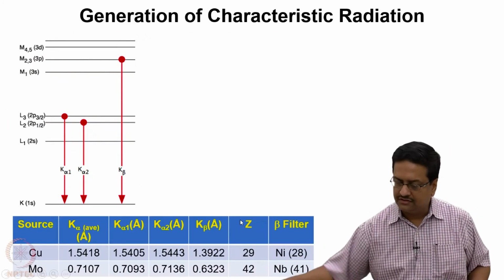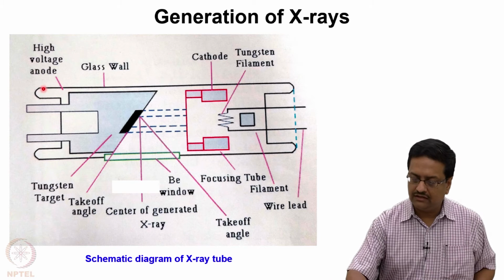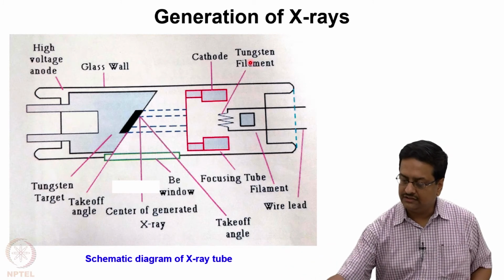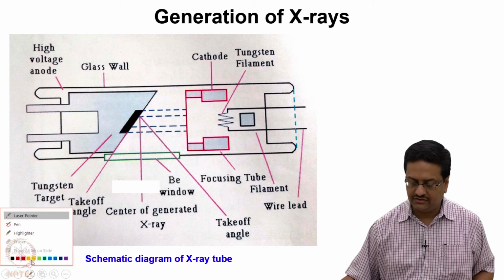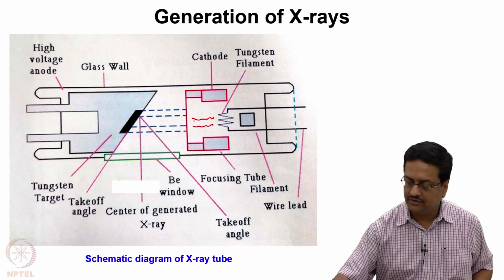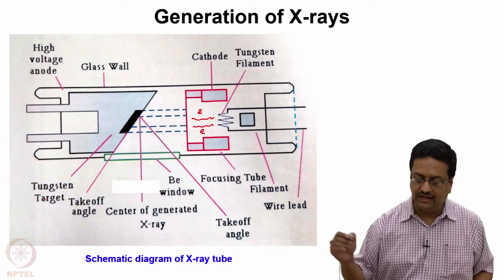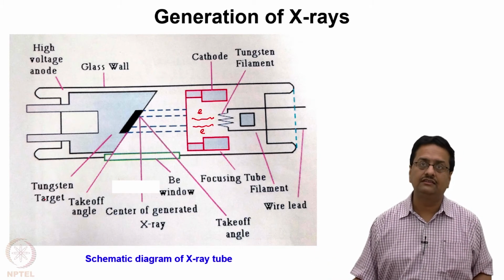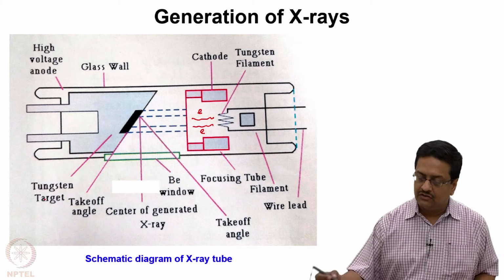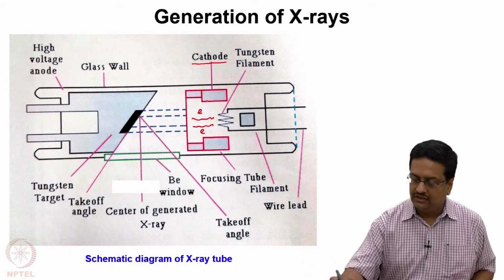See, this X-ray tube is a glass walled tube kept under high vacuum, and there we have a tungsten filament which is used to generate electrons inside this evacuated chamber. Those electrons are emitted from the filament and allowed to run towards the anode, because in X-ray crystallography we generally use copper, molybdenum or silver as anode because of their characteristic wavelengths. So we use a suitable anode, and what we have here is a cathode and the anode.